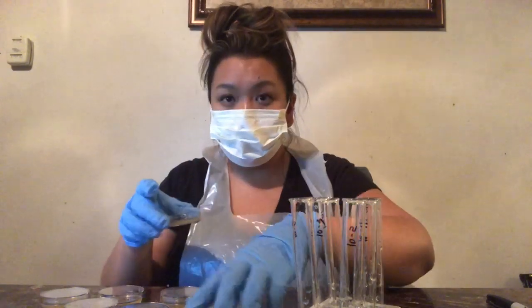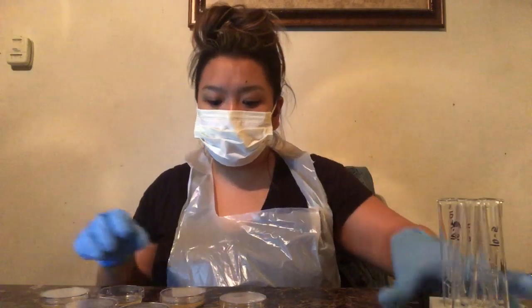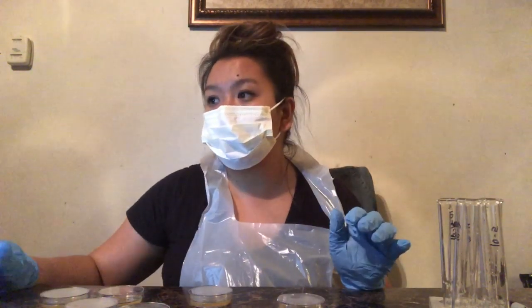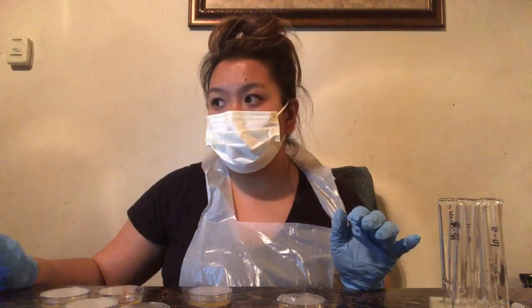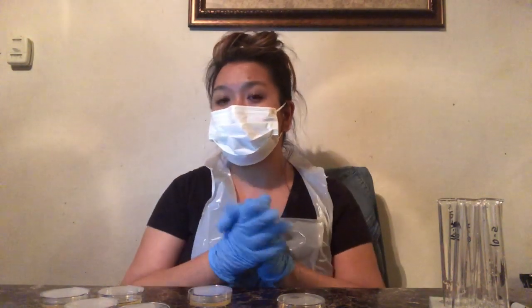Okay, so all of that has been plated in the agar. What I'm going to do is place my agar in my incubation area top side up for 12 hours, and then flip it over and let it incubate for another 36 hours and go from there.